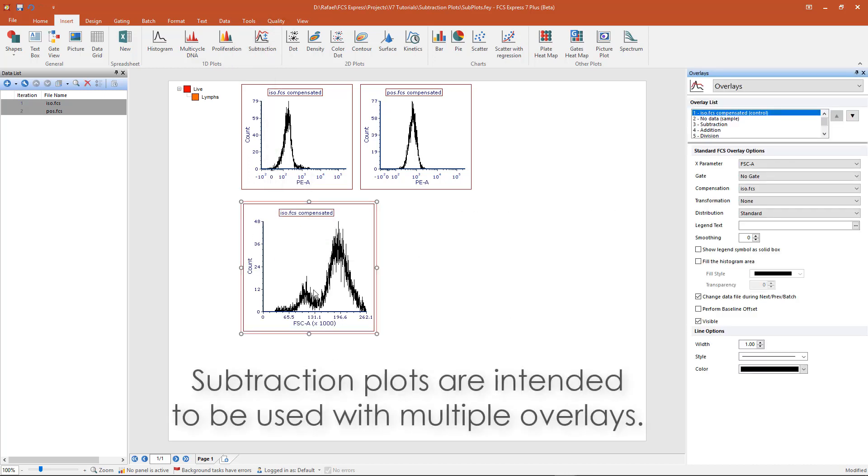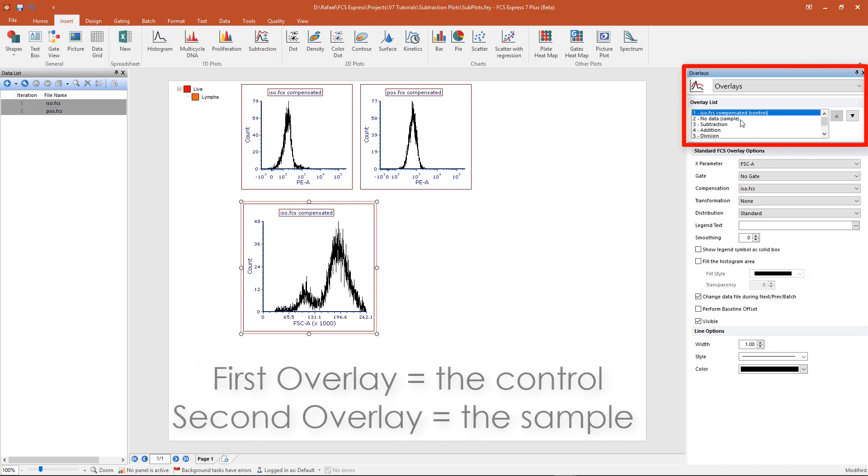The subtraction plot will default to showing the current data file as the first overlay, and no data file as the second overlay. The first overlay will by definition serve as the control histogram.